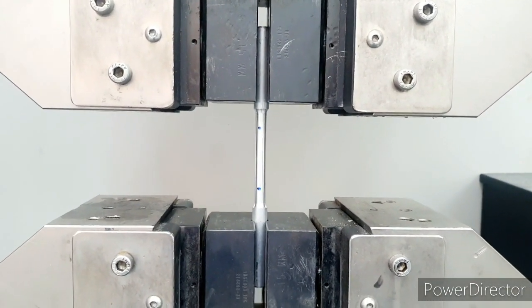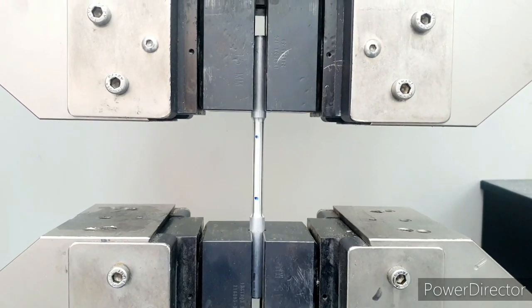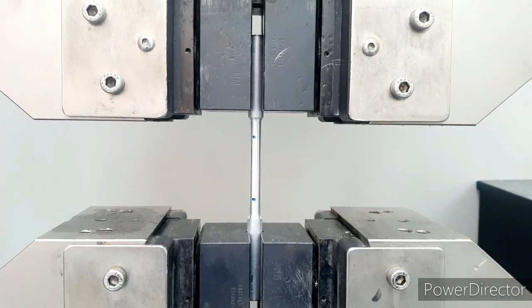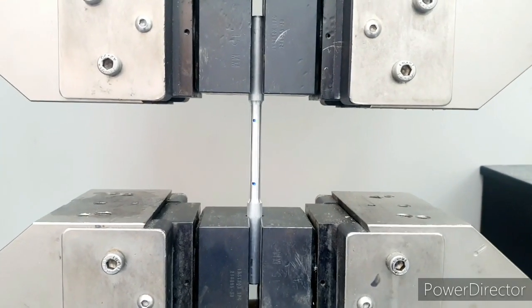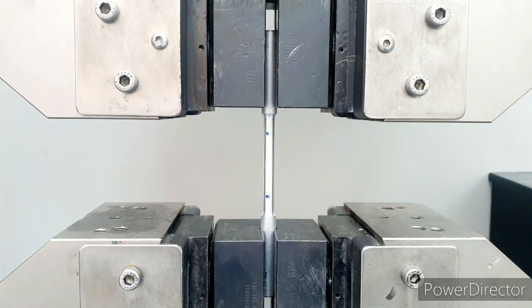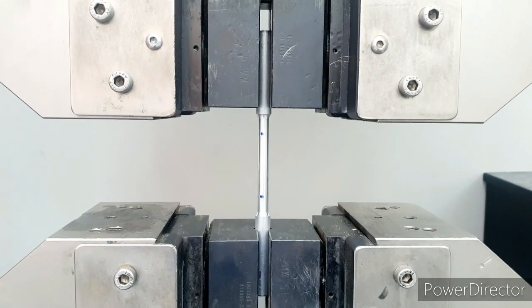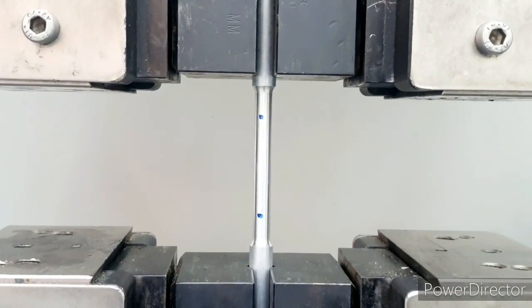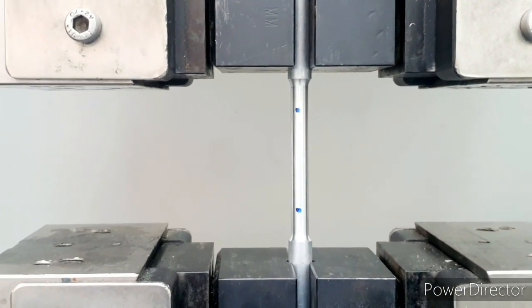The difference between aluminum and steel is that there is not a very significant transition between the elastic and plastic region. That's why the point of yield, the start of plastic behavior and the yield stress point, is not very clearly defined. That's the difference between aluminum and steel. But here we will see and experience the necking behavior also, the same as steel, and we will see the reduction in area from the center.